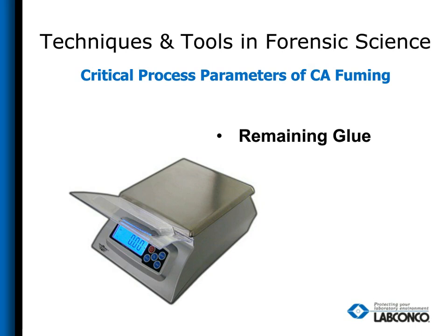This is important because that last 10%, we find, between particles or other material in the CA glue formula, doesn't all volatilize. So you're always going to have some residue left over. And when you get to this final 10%, the time it takes to volatilize that remaining part off takes so much longer than the first 90%. It can add into overfuming and other issues.